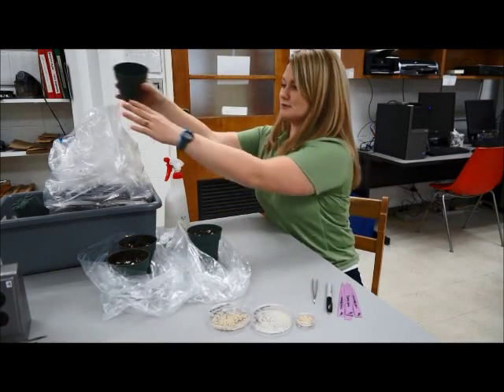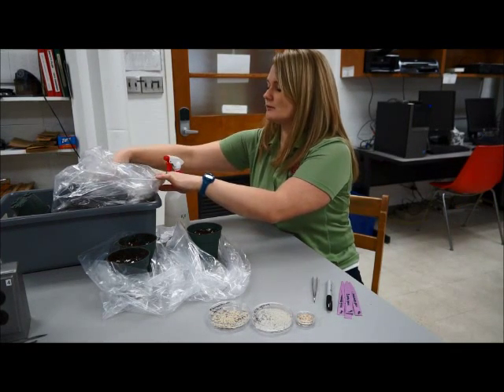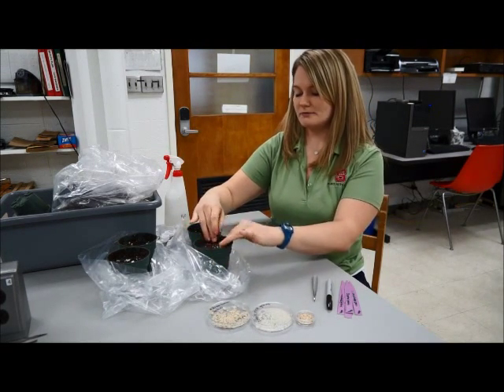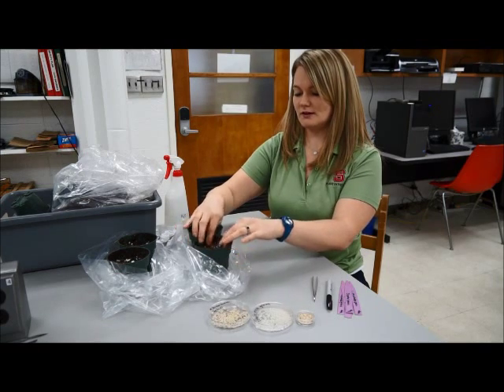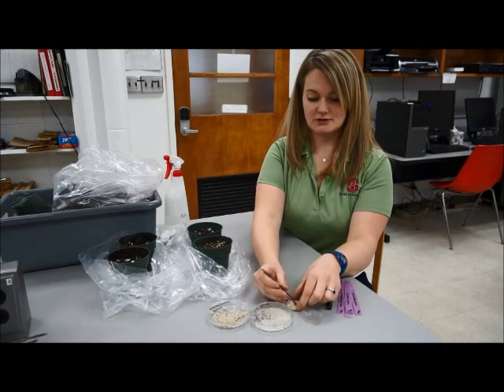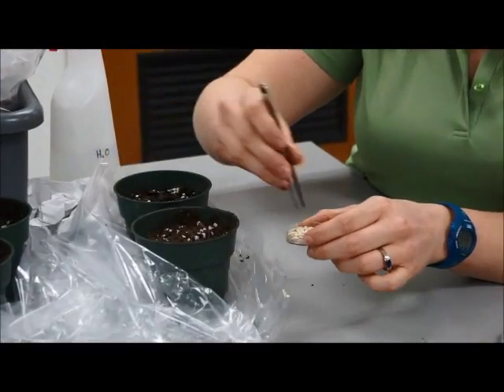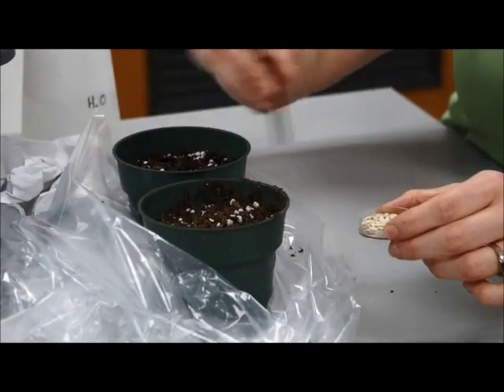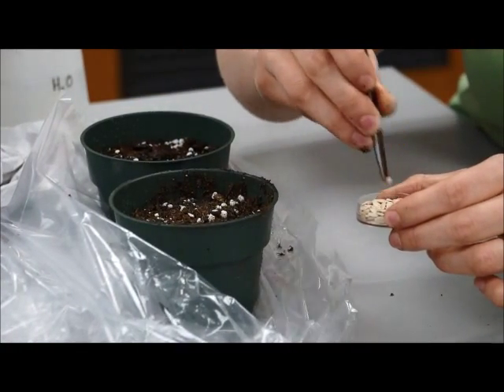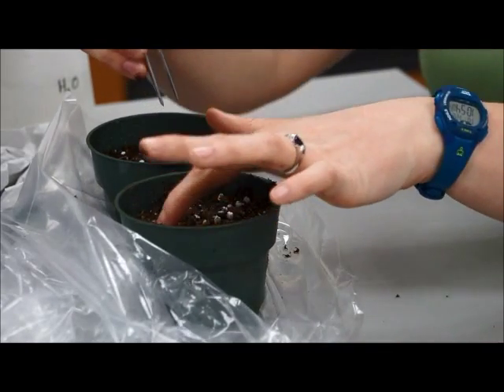I've already potted three pots, so we'll go ahead and do our last one. We get our soil — or media — and fill it up just about to that first little line. We're going to place eight cucumber seeds, and I've also placed eight cucumber seeds in each of the other pots. You want to place them about one centimeter down into the media, then cover them up.